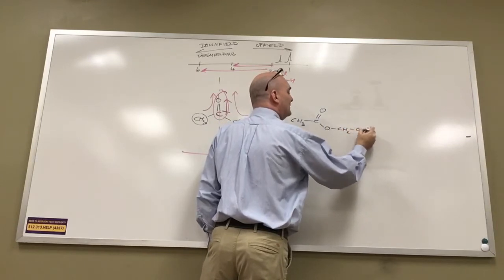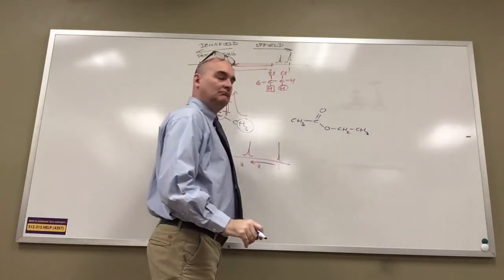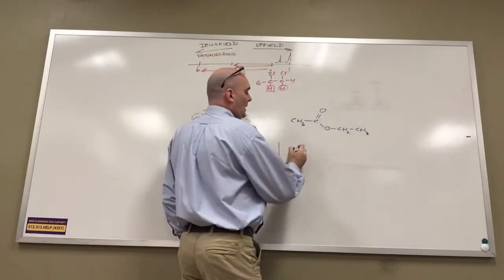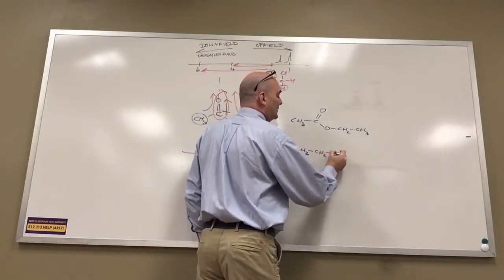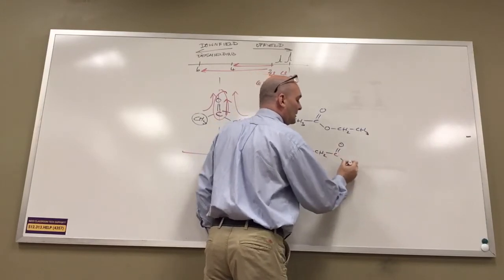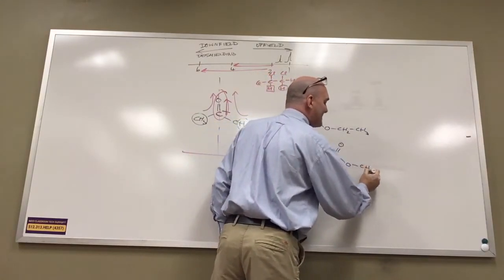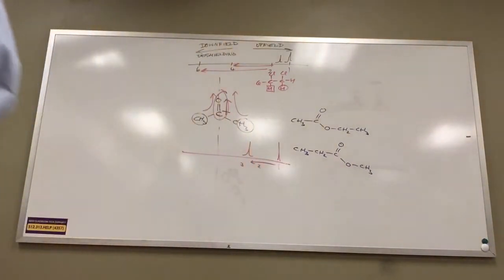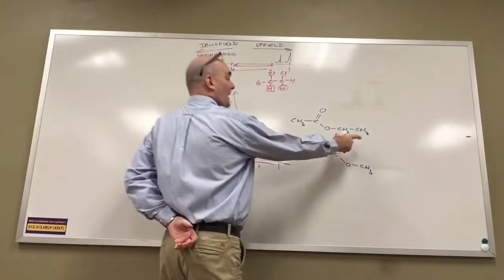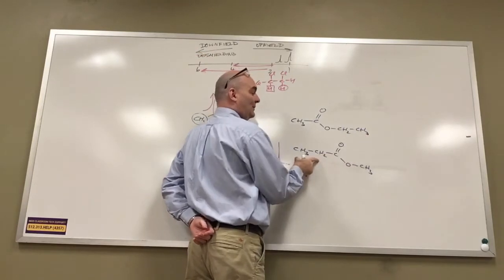This is an ester. And we're going to want to know what the difference between those two is. I have an ethyl group, I have an ethyl group.